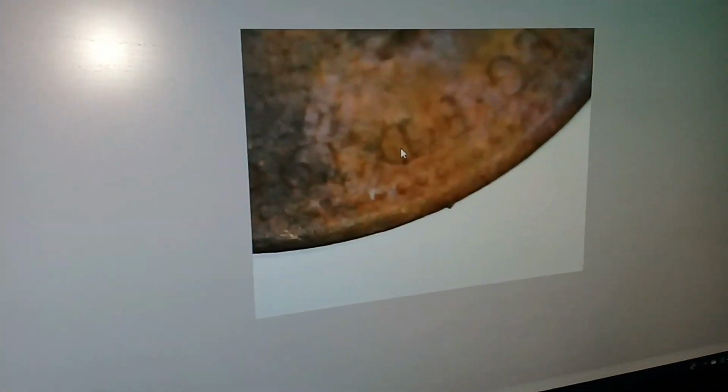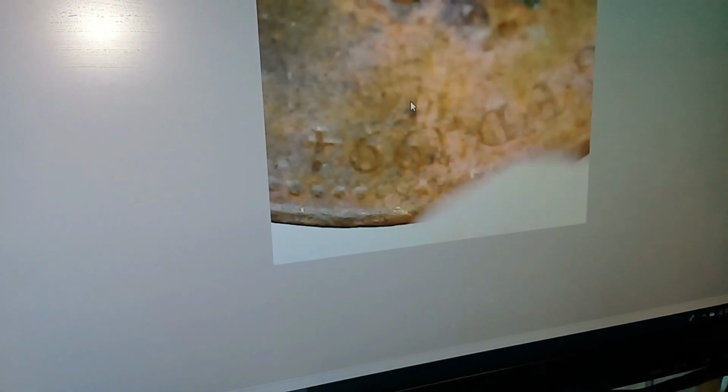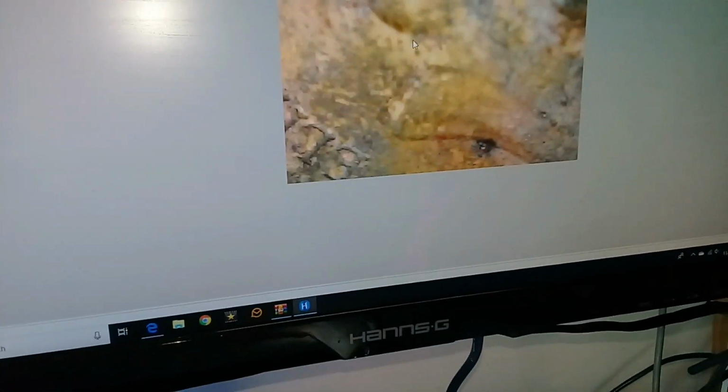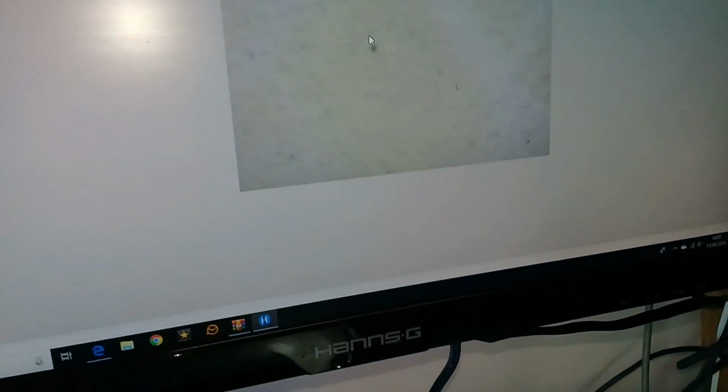Yeah, that's good. See, that's the thing, with an eyepiece, it's a bit of a pain using them. Especially the ones that have that mega magnification, which means in the end all you're doing is kind of, I think it inverts the image, but they're really not that great to use. See my fingernail there, it's quite dirty, isn't it? What about my finger? Ooh. What are those white bits? Oh, it's sand. So you could look at a grain of sand with this thing.